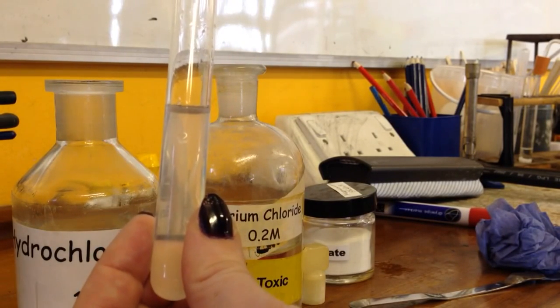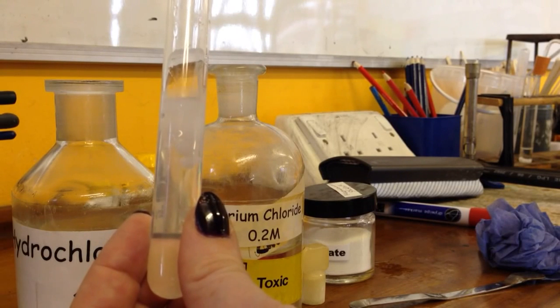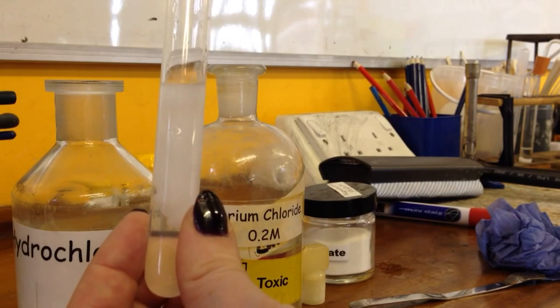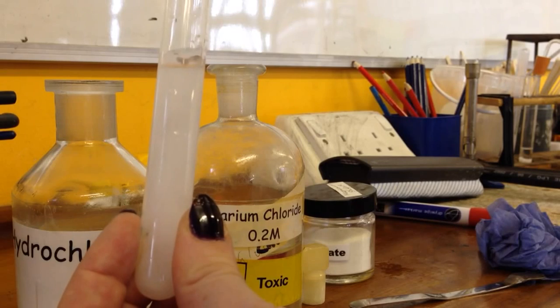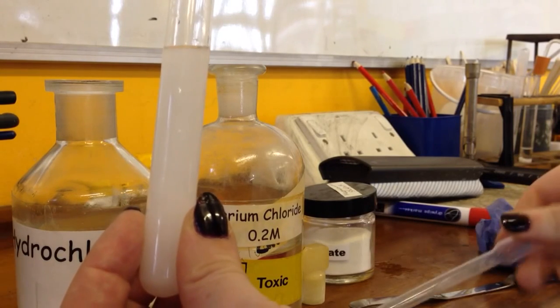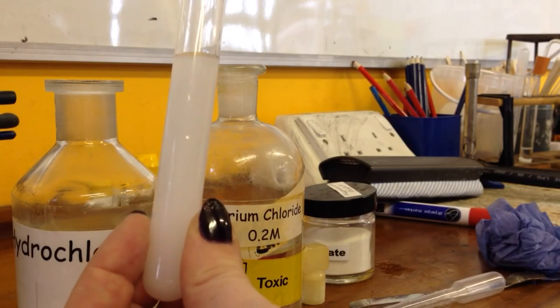So just watch what happens when I add in the barium chloride. Hopefully you can see that quite a strong white precipitate is being formed and it's going white and cloudy.